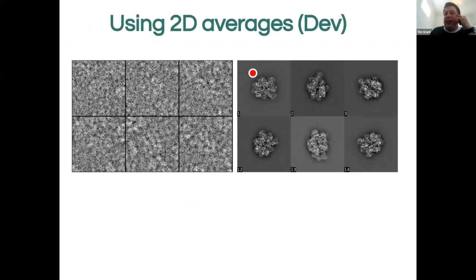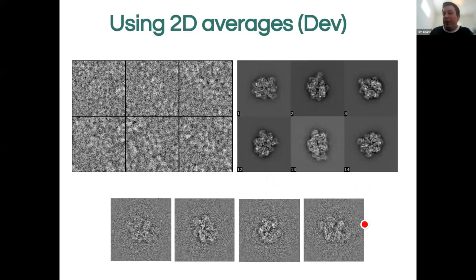Getting 2D class averages is much simpler than getting your 3D ab initio. You will all know that you can start with a random blob and you will end up with nice 2D class averages. You cannot really do that for 3D. So why do we tend to just do these class averages, select the nice images, and then go back to these kind of images and forget all of this information? What we now do is take these classifications and make kind of faux images from them.